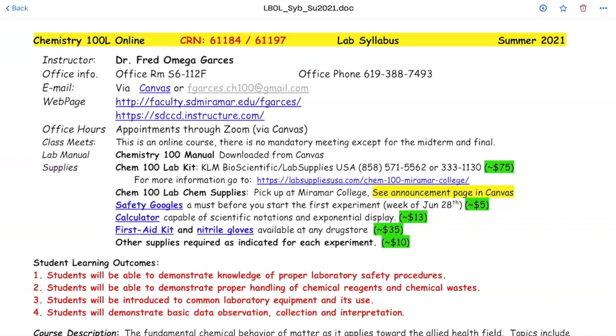Look like this, okay. They look like this. And some people are allergic to latex, so nitrile is probably safe. And these things are easily bought, you know, with the COVID things, these things came out. You can go to like a Walmart, a Target, Harbor Freight, they'll have these.